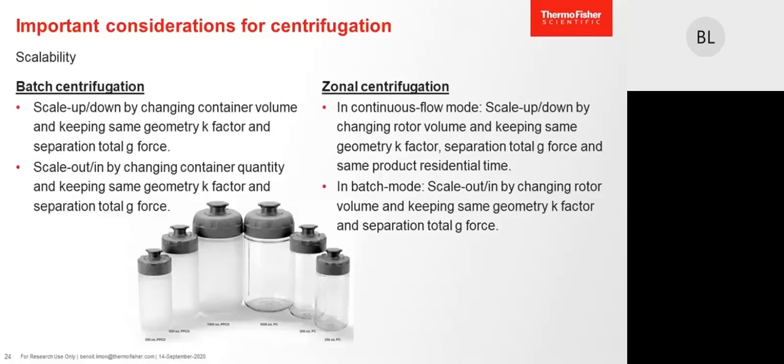you can increase the size, the scale, by increasing the number of containers, or volume of containers, or quantity of machines.